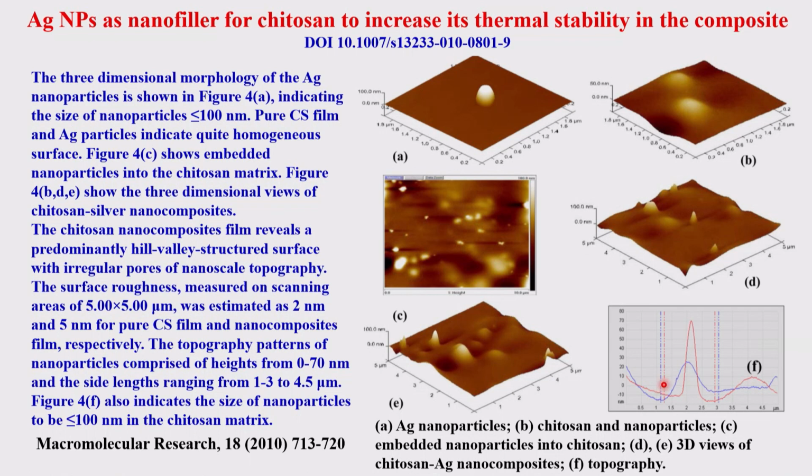So you can measure these topographic features, that means the elevations, the ups and downs, in other words the surface contours with the z direction parameter. From here you can get the z direction parameter, which is also the roughness parameter. You can get how this is distributed, and you can restrict the range or expand the range and study all of these kinds of things very well.